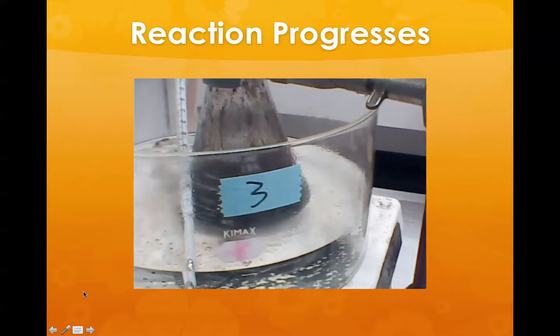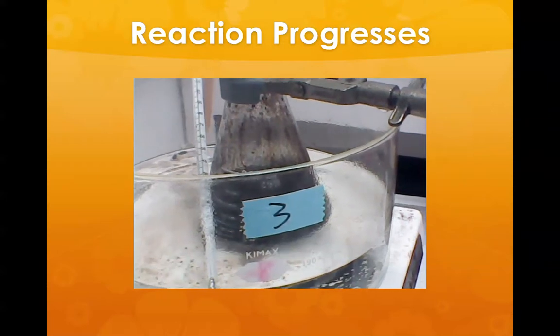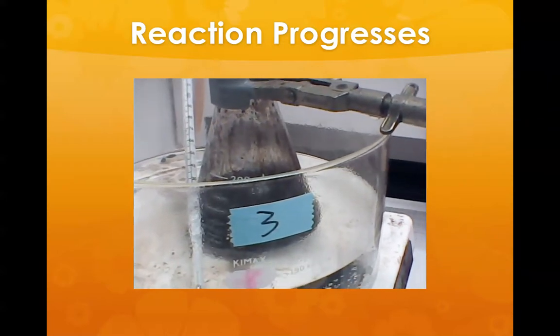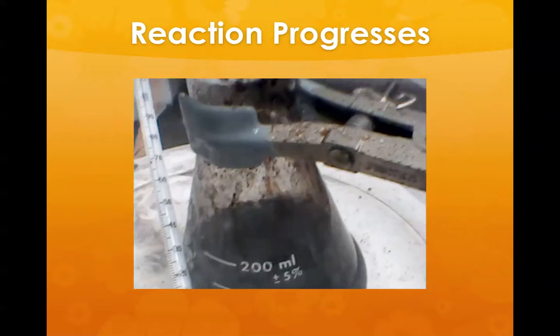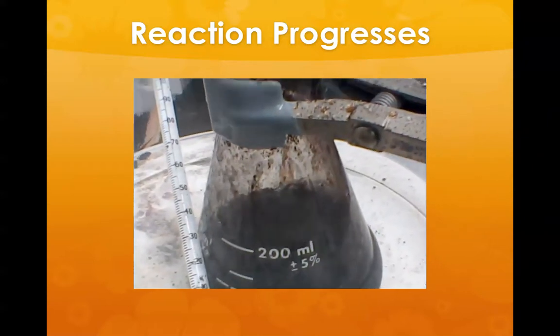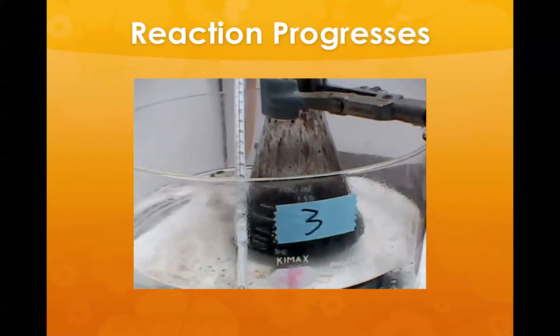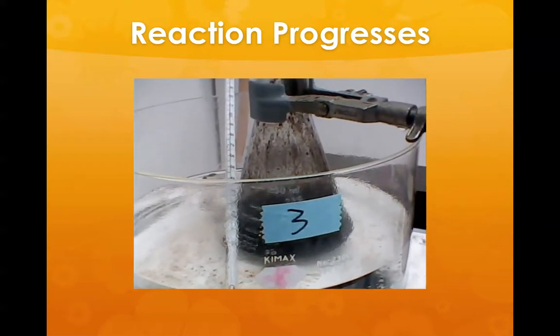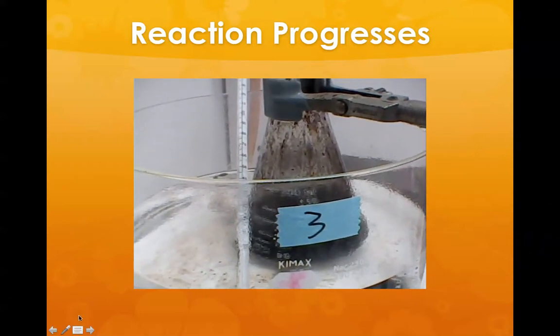Okay, how long has this been going now? It's a silicon oil bath. It's about an hour. All amino acids are in there? It's still stirrable. Water is being driven out at this temperature. Later on, we'll have a nitrogen sparge blow the water vapor out that's forming.